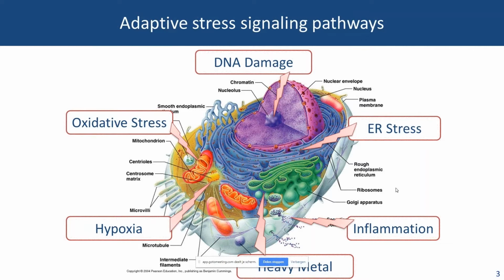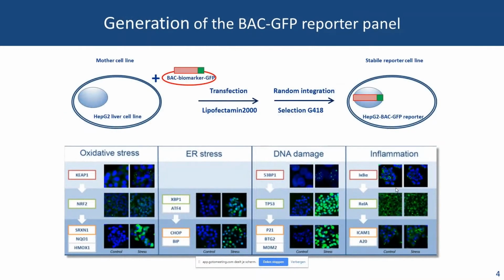And if you want to study these responses, there are different ways. You can, for example, make use of Western blotting, RT-qPCR, or stainings, but these have very large variation, and they're really labor intensive, and it will just cost you a lot of time. So in Leiden, we think of a different way of studying these very dynamic responses, and we have chosen the reporter model.